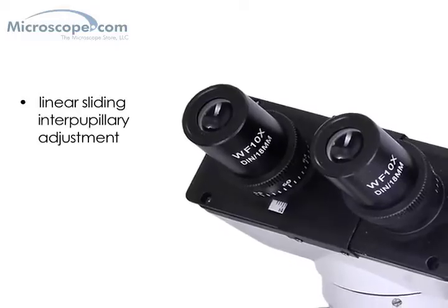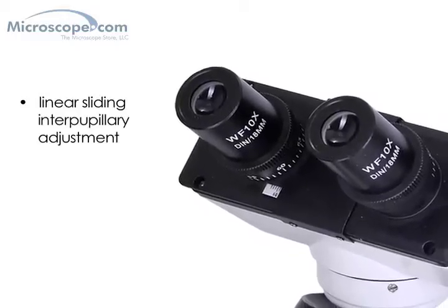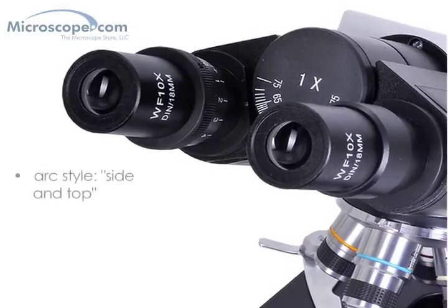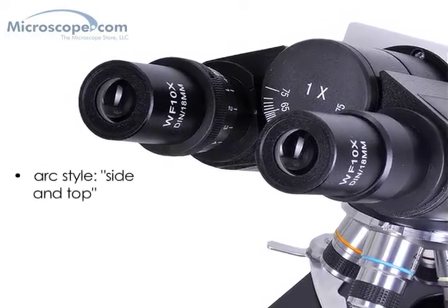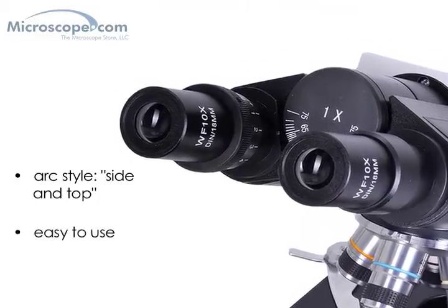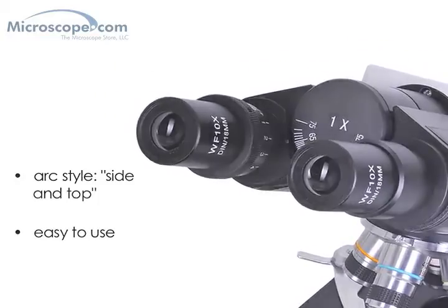The other difference is in the microscope heads. The B4 model features linear sliding interpupillary adjustment, while the B4S has the arc style known as side and top. Both are high quality, but some users prefer the side and top style due to its ease of use — it's very similar to adjusting a pair of binoculars.